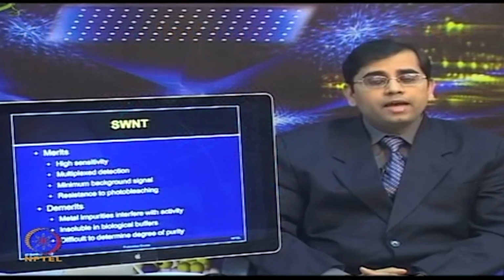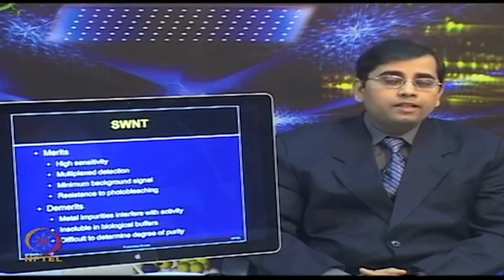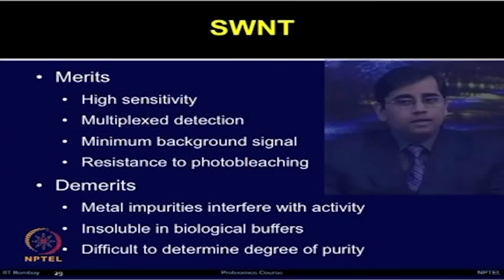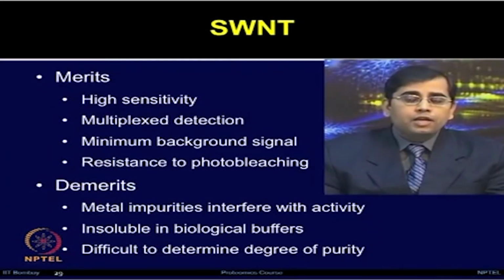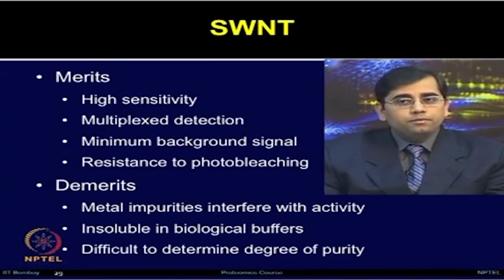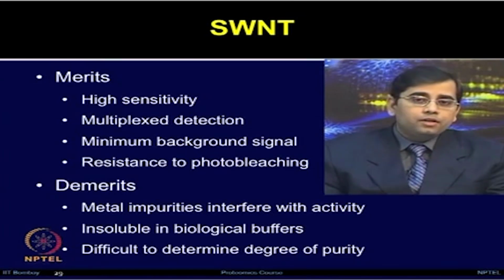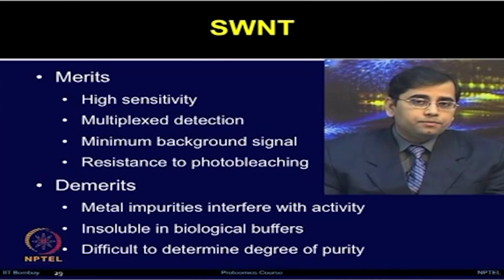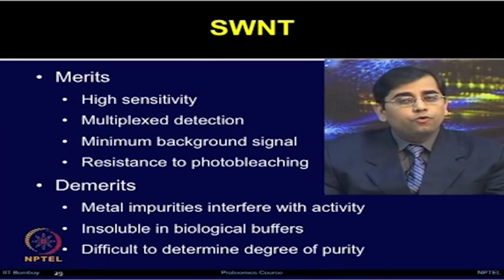The single walled nanotubes offer several advantages such as high sensitivity, the multiplex detection capability of proteins, minimum background signal due to the sharp scattering peaks, as well as high signal to noise ratio. They also offer resistance to photobleaching.